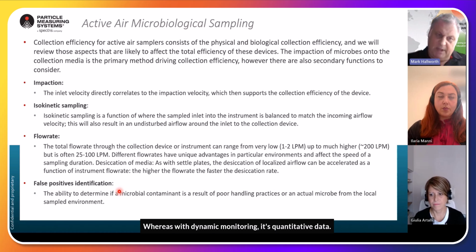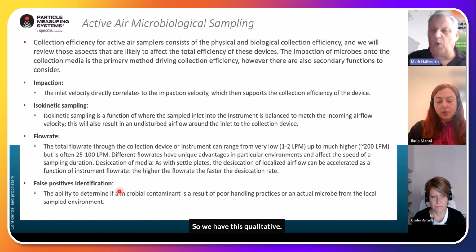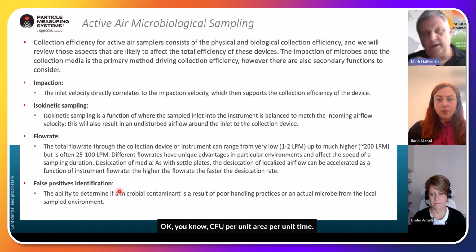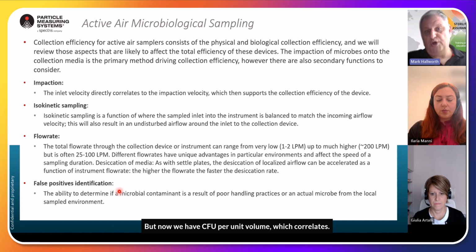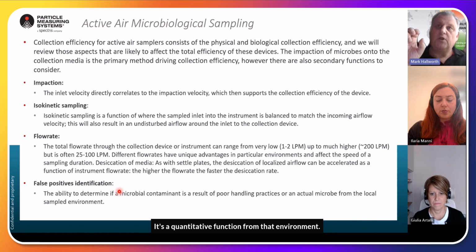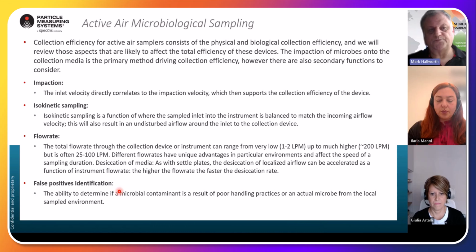Whereas with dynamic monitoring, it's quantitative data. So we have this qualitative, is there growth, isn't there growth? CFU per unit area per unit time. But now we have CFU per unit volume, which is a quantitative function from that environment.